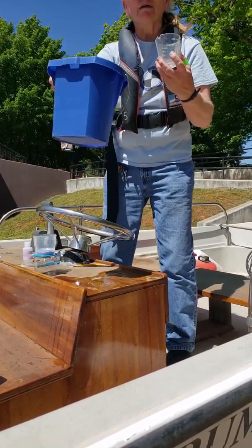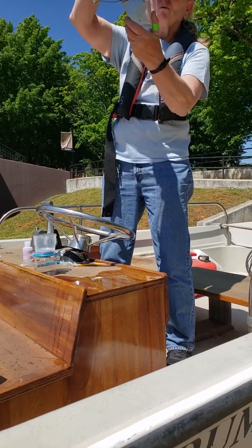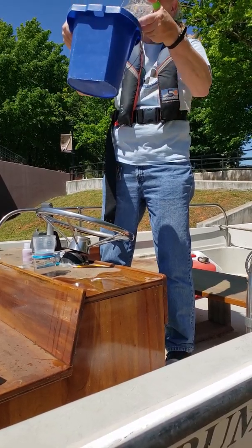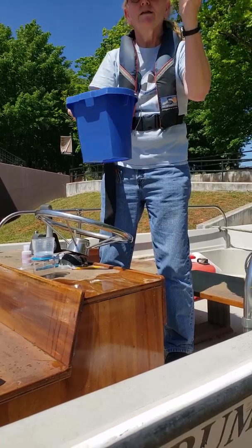Swirl the sample water again and pour out 100 milliliters into your measuring cup.